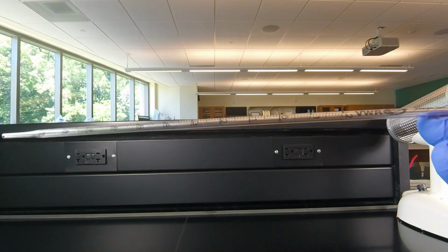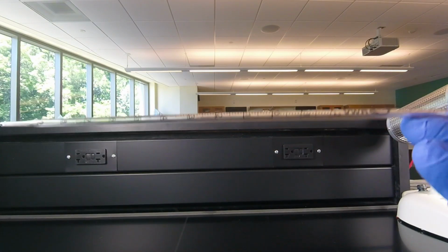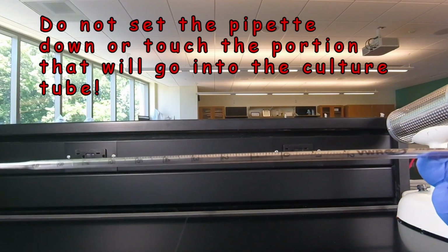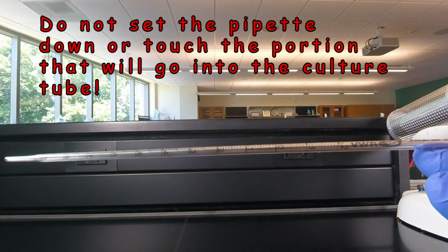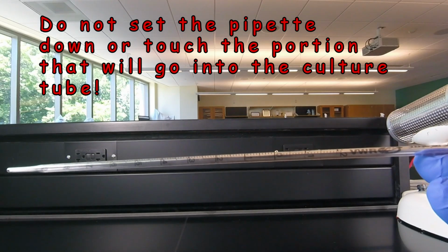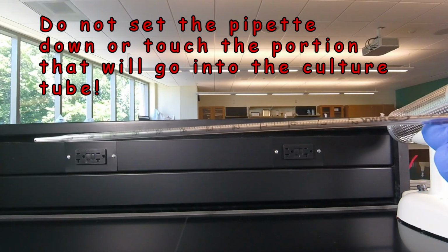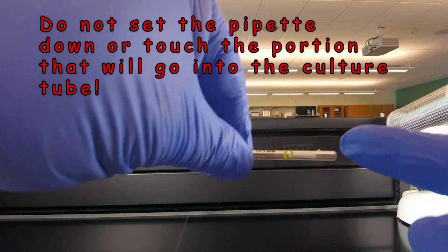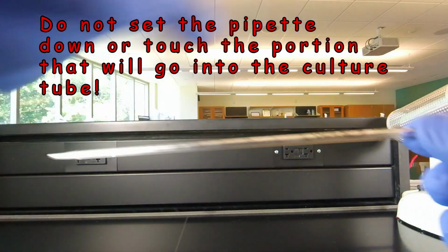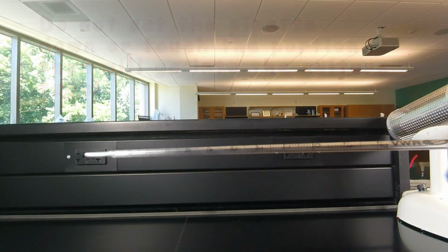Now notice, once we have the pipette out of its protective wrapping, we can no longer set it down because that will contaminate the pipette. We don't want to touch the part that's going to go into the tube with our gloved hands because they're not sterile. They've been touching surfaces. So again, we can only hold it in the air, and we hold it by the end where the cotton is, right here, without touching the portion that's going to go into the test tube.